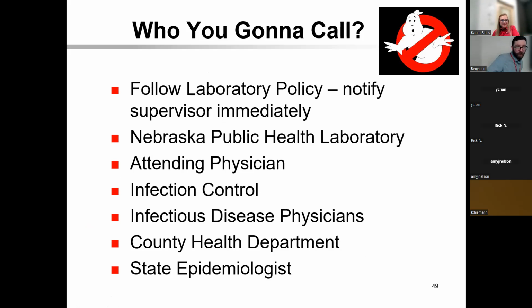So following our laboratory procedure, notify your supervisor and get a hold of Nebraska Public Health. The attending physician and infection control need to be notified at your location. And some things will require the notification of county health and state epidemiologists.